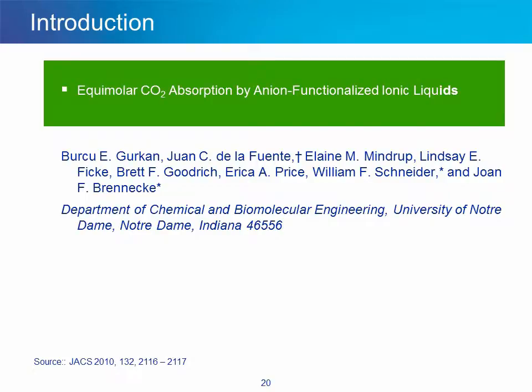The third and final paper that I have selected comes from the Journal of the American Chemical Society and was published on the web on February 1st, 2010, so it's also a relatively recent publication. It comes from the Brennecke Research Group at the University of Notre Dame in Indiana. The title of this article is Equimolar CO2 Absorption by Anion Functionalized Ionic Liquids.